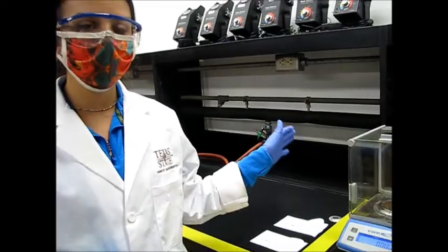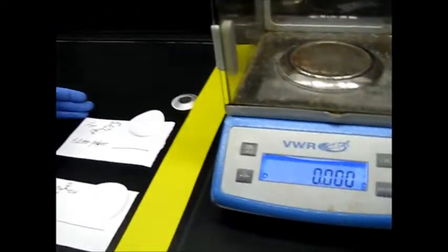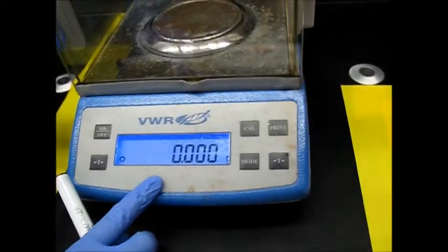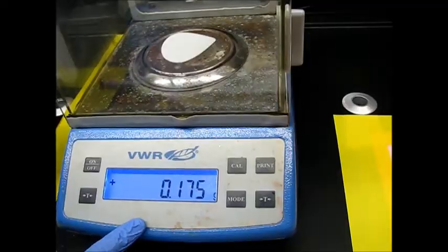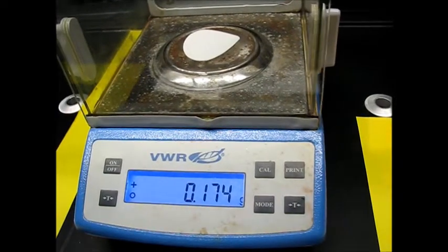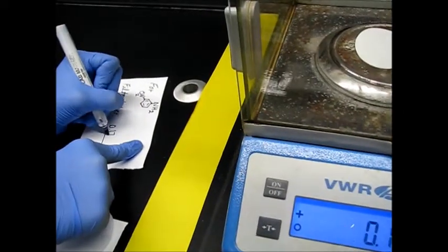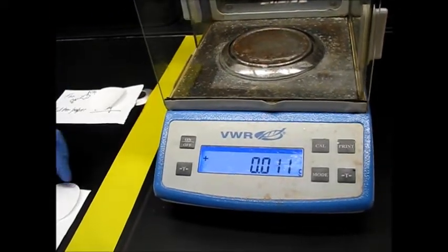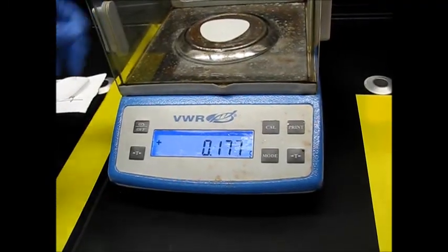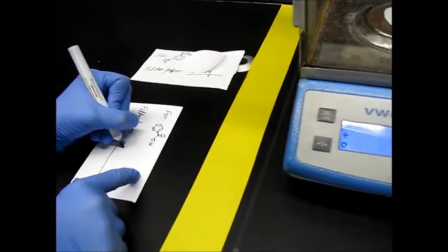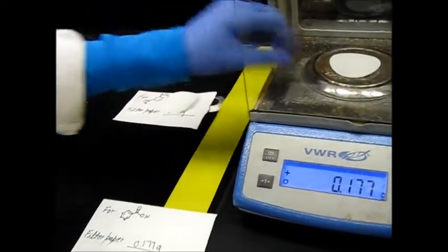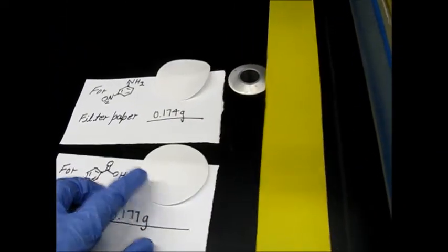So now we will use the balance to weigh out the filter paper that we will be using for the vacuum filtration. For the nitroaniline this is going to be our filter paper. Make sure that it's at zero. Open the glass and place the filter paper directly on the balance. We will record to three decimal places. And do the same thing with the benzoic acid. So here we have pre-weighed filter paper.